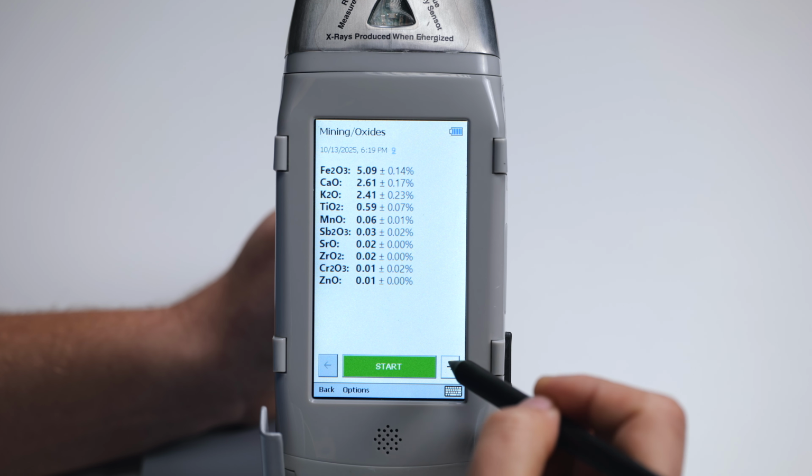In many standards for ores and cement raw materials, this parameter is mandatory. Most geological, cement and ceramics laboratories work with oxides composition because, first, technical specifications and international standards usually define composition as SiO2, Al2O3, Fe2O3 and etc. Raw mix calculations for clinker, glass or ceramics are done in oxide form.